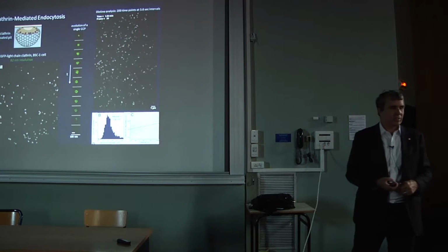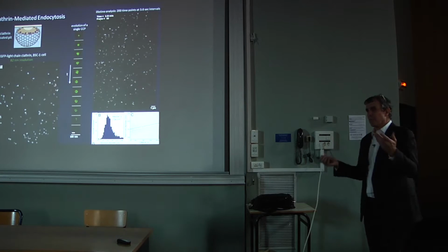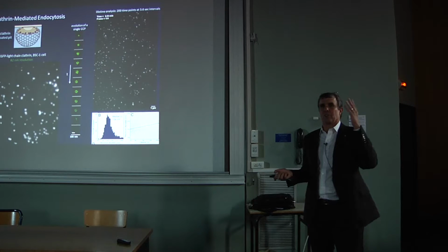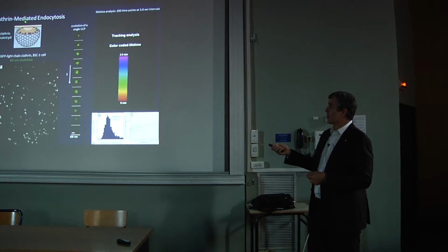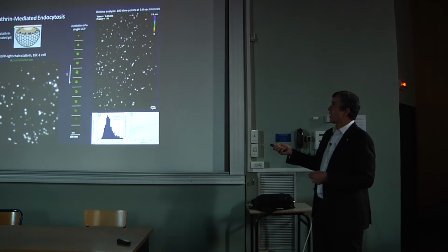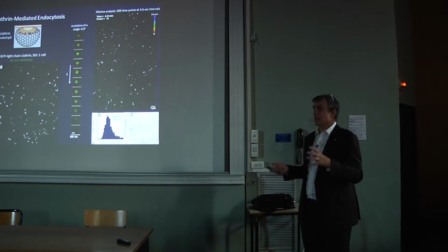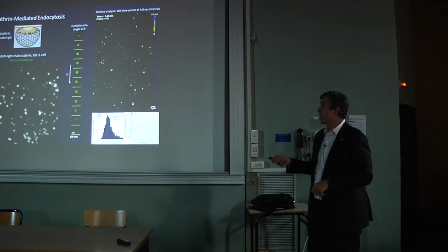So we've used that to study what's known as clathrin-mediated endocytosis. The plasma membrane of the cell is the gateway of the cell, and obviously cargoes need to get into that cell. One means is these molecular cargoes come to the membrane, dock, and then there's an invagination of the membrane controlled by this protein called clathrin, which forms this basket that then pinches off the membrane.